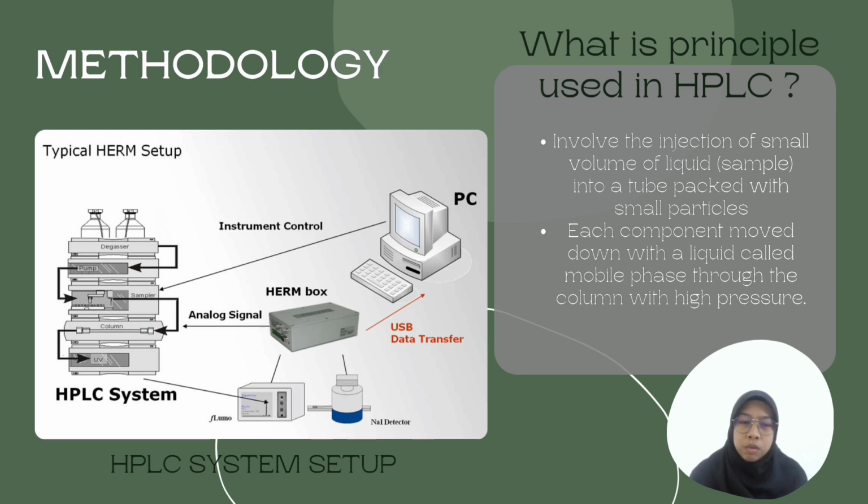The principle involved in HPLC testing is the separation of compounds in a mixture more efficiently and also more quickly than that of traditional column chromatography. The concept used is like dissolves like, and this is one of the principles for chromatography. The image shown here is the HPLC system setup, and the division of compounds is due to their relative difference in travel through the column on the application of pressure exerted through the mobile phase or carrying liquid.